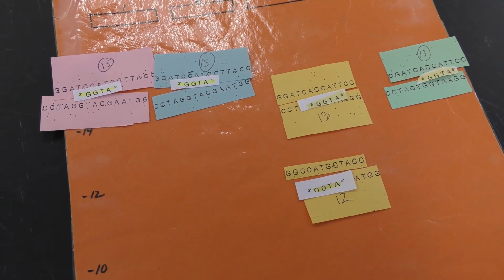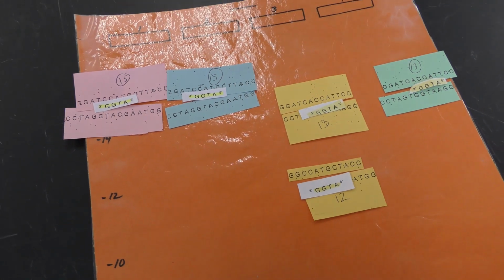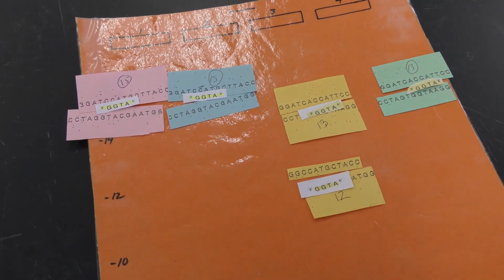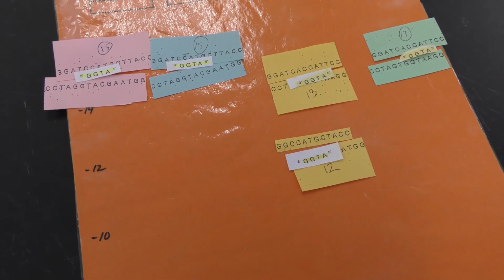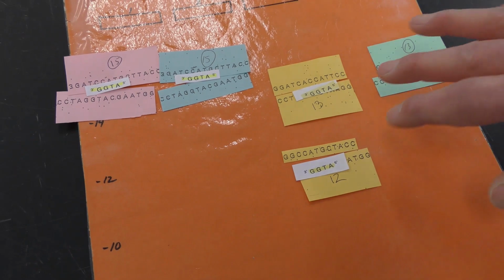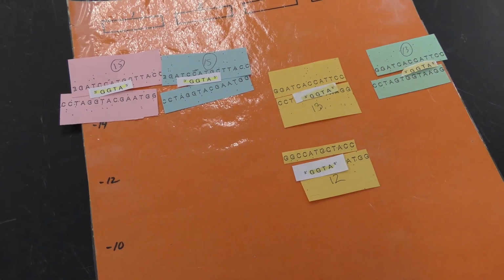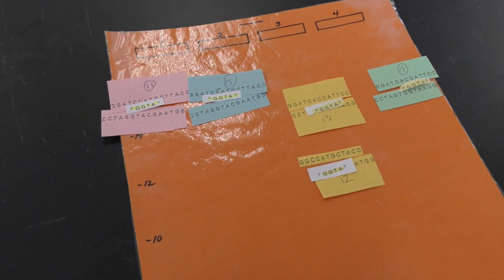The answer to the first question, you cannot differentiate between DNA 1 and 2 because the probe hybridized with the same size fragment. But between DNA 3 and 4, yes, using Southern blot, I can differentiate between DNA 3 and 4 because 2 fragments were labeled with the probe here and only 1 here. And so that's the advantage of using the Southern blot procedure.